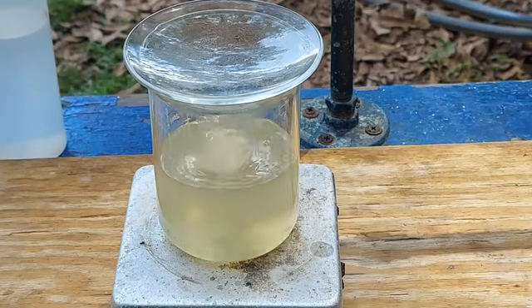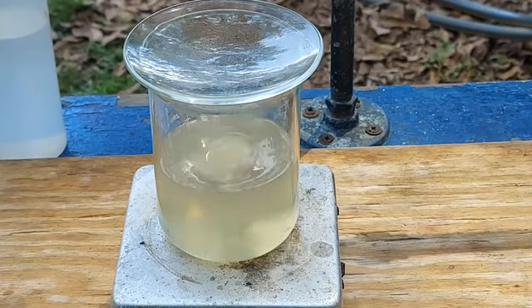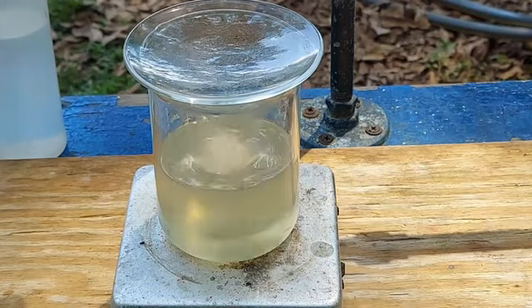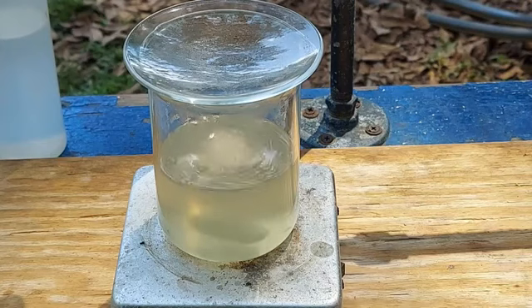We want the solution to be hot but not boiling. It should eventually completely clarify. We'll let it do this for a little bit, and then we will filter this through a plug of glass wool that's been compacted pretty tight. It'll take a long time, and it'll be tedious, but happily, mercuric nitrate is nice and soluble. Glass doesn't react with acid, and it should capture any teeny tiny particles that are left over, we hope.